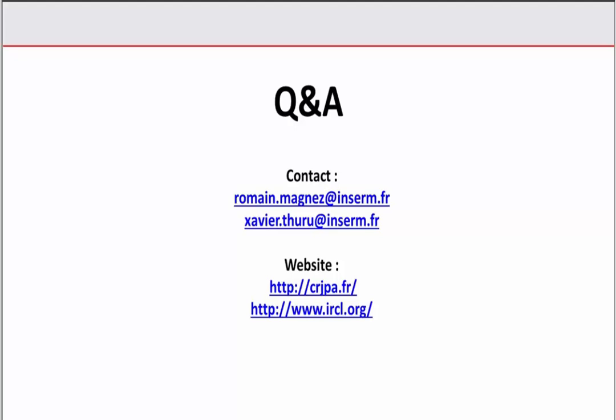Excellent. Our next question: how long does an MST experiment take, and how many molecules or ligands can you test per experiment? So basically, it depends on if you want to do a replicate of your test, but you can get access to a KD within something like 20 minutes. And for the screening, I think you could screen a molecule per minute if you are setting up the right assay.